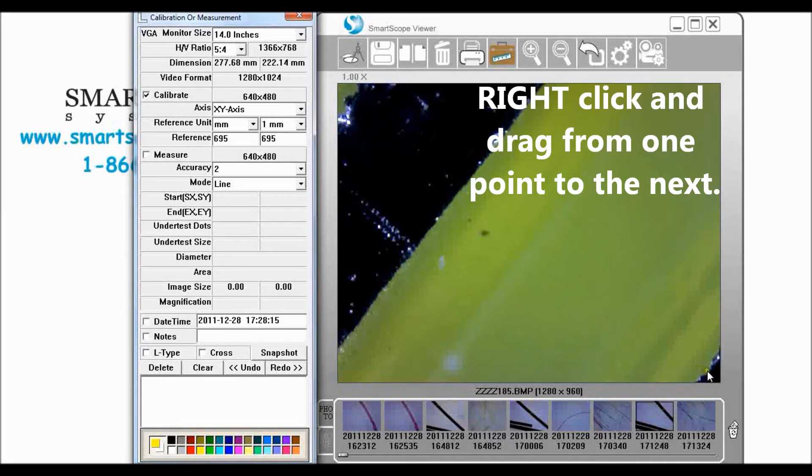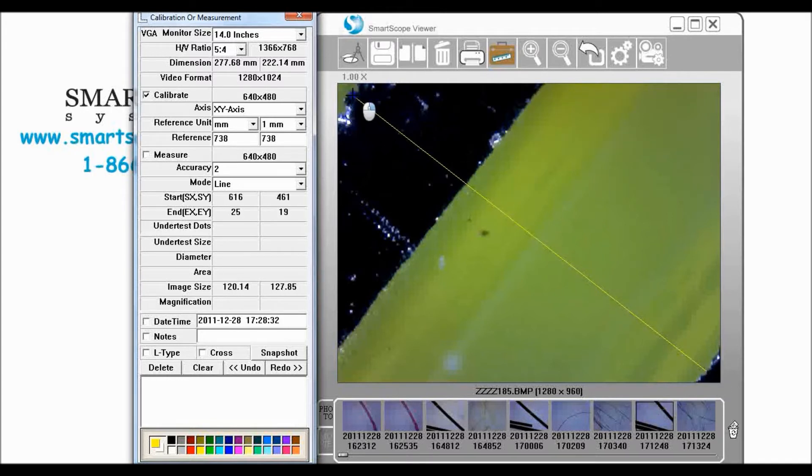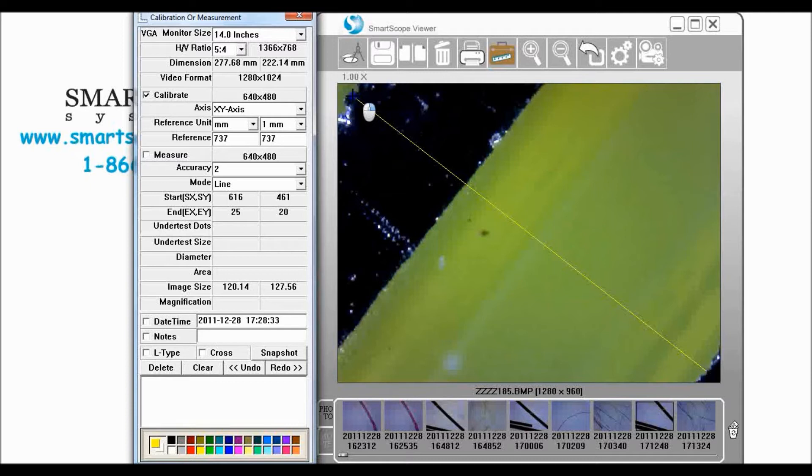What you'll do is you'll right click, so you're going to right click and drag from there up to the left side of that marker and once you get it in place you release and now you're calibrated.